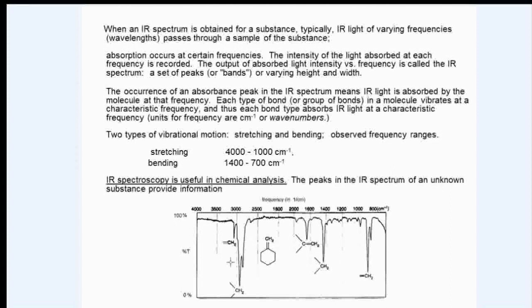It's actually a couple of peaks. But both those peaks, and they appear about 2950 units, 2950 wave numbers, is caused by the CH stretching vibration of an alkyl CH. All the methylene groups, the CH2 groups in the cyclohexane ring, it's the stretching of the CH bonds that's creating those peaks at about 2950 or so.